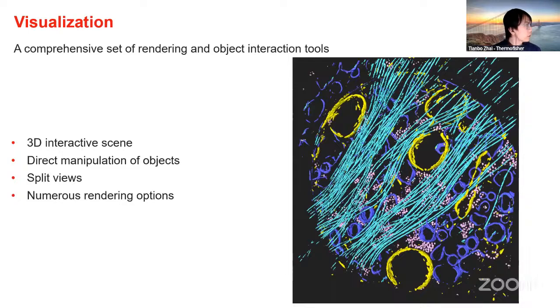After the pre-processing part, being able to visualize is important in many ways, especially if the data set is very large. It takes really long if you start analysis right away without having a full understanding of the scope of your data set.